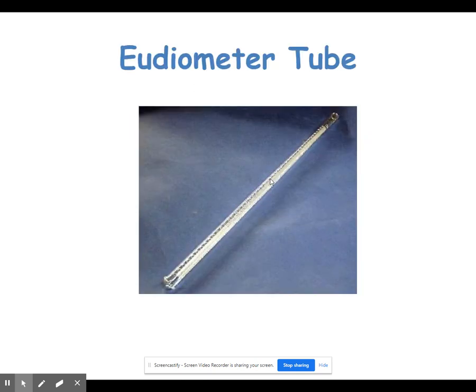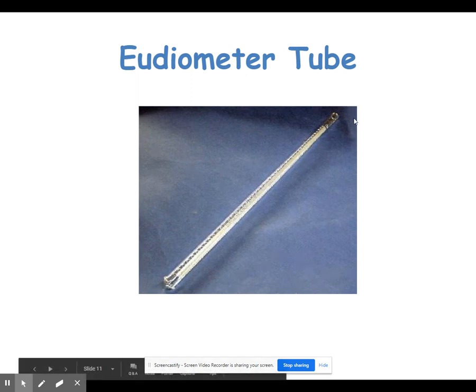The next piece of equipment looks similar to a burette but is a eudiometer tube, used to collect a gas produced from a reaction. One end is sealed off, one end is open, and the gas produced in a reaction is collected in the tube. There are markings on the tube to note how much gas was collected. The tube would be filled with water, the gas produced would displace the water, and you could read how much gas was produced in the reaction. Hopefully we'll use this a couple of times in lab.